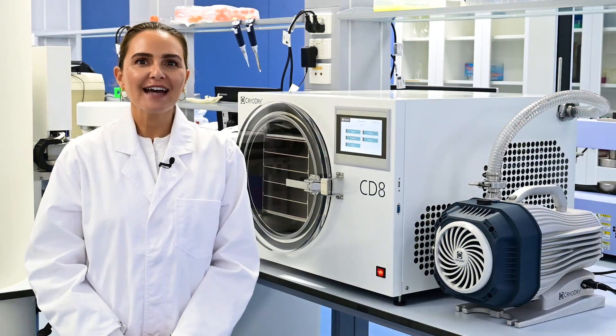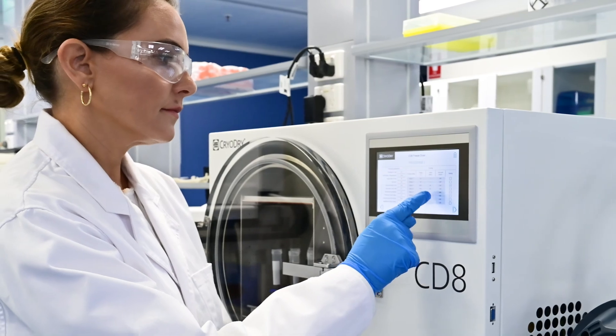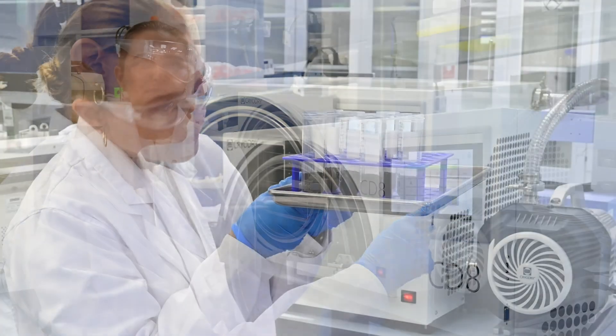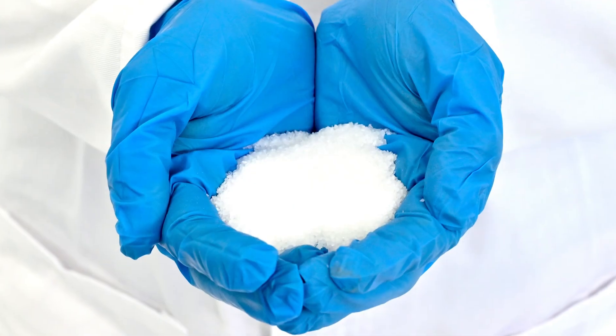With the CryoDry CD8, you have complete control over the process, ensuring that your lab samples or products are first frozen precisely and then dried perfectly while also saving time.